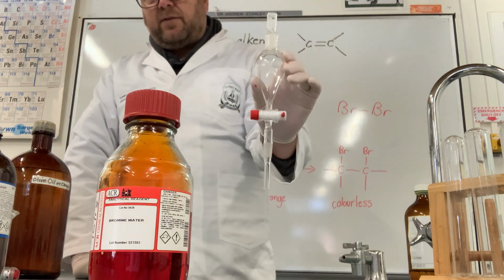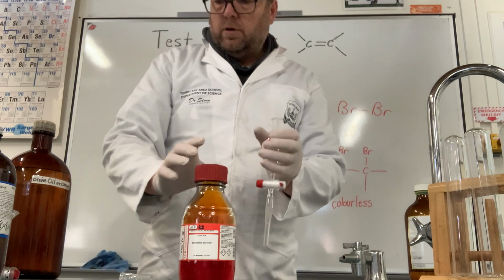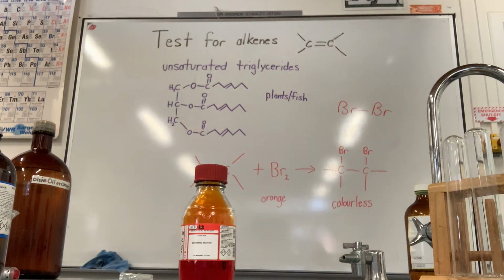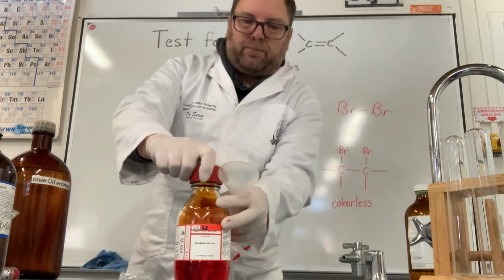So we use a separating funnel. With this separating funnel, we're going to firstly add a little bit of bromine.